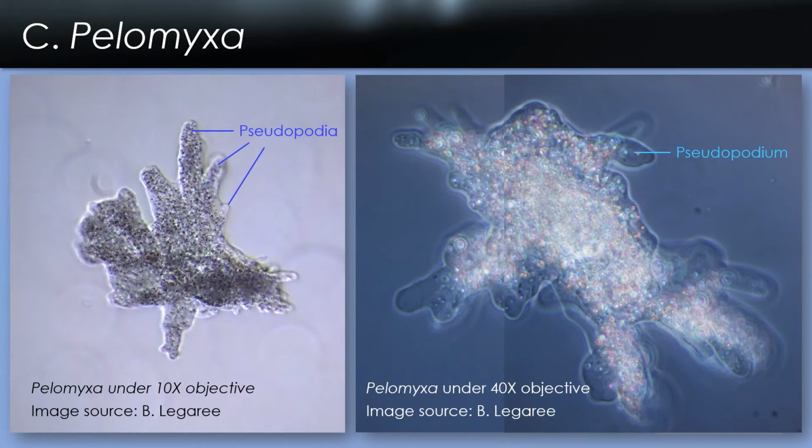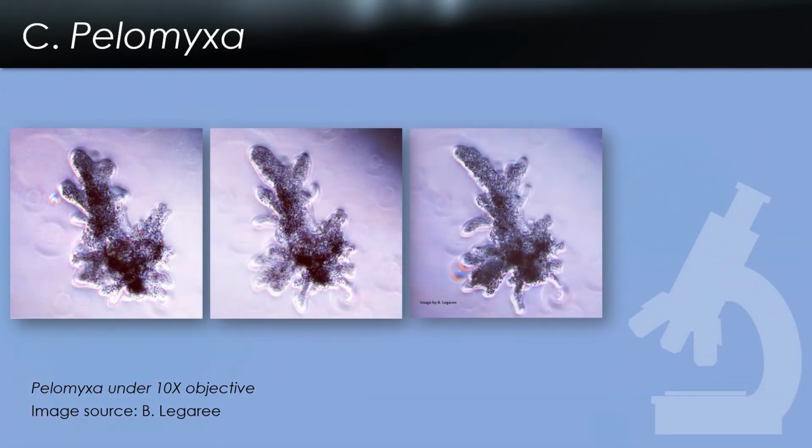There are some great videos of amoeba on the internet, tons and tons of them showing phagocytosis. In this exercise, though, I want you to look at videos of amoeba basically moving around.